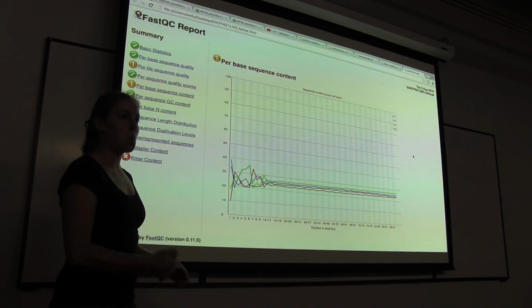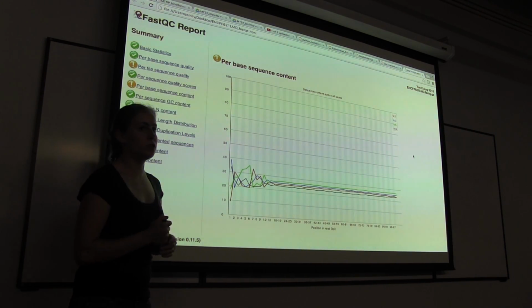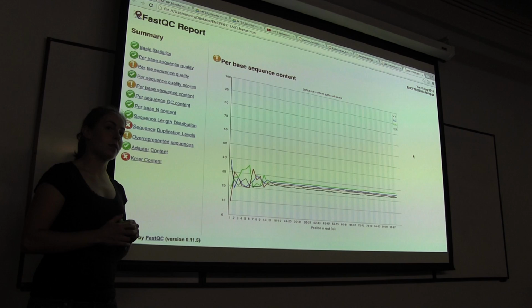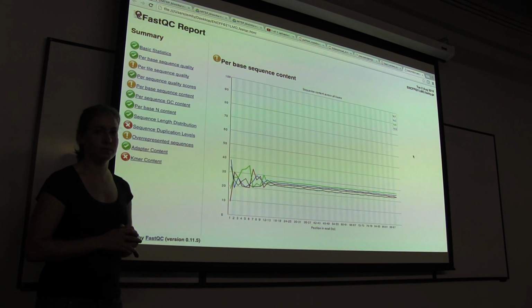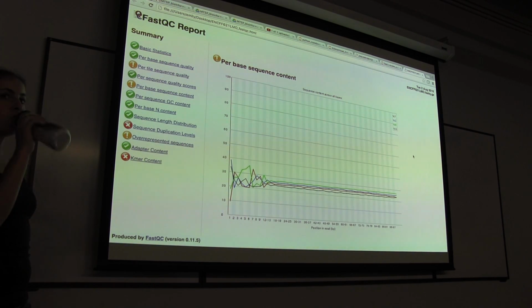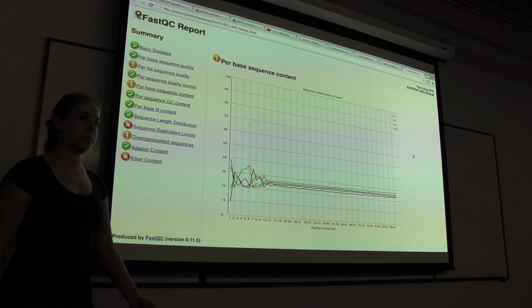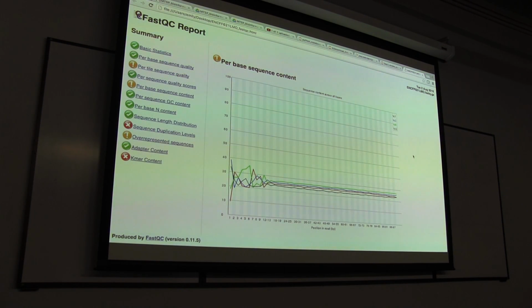Yeah? No. So you will upload your data, or yeah, go ahead. So they will ask for your raw FastQ, so they can run FastQC themselves. Right. So if you want to download someone else's data from a paper that you see published, you can run FastQC and you should get exactly the same results. So you're not required to post these files because they're easily generated. Right. So you upload your FastQs when you submit a paper. Would you ever upload before that, the raw file?